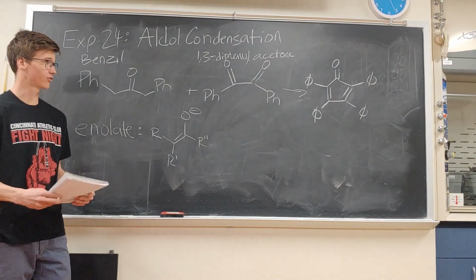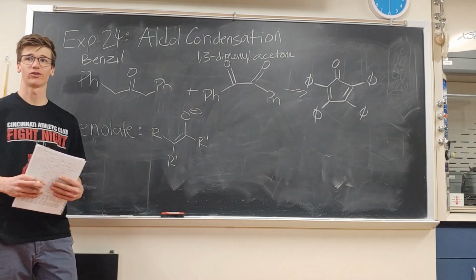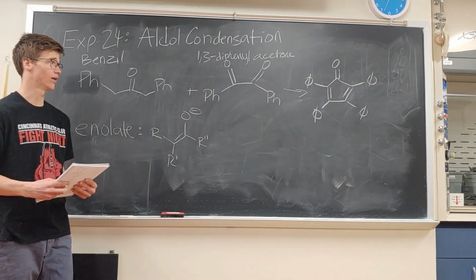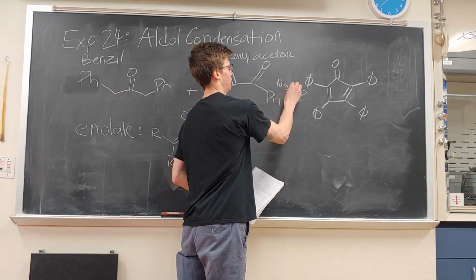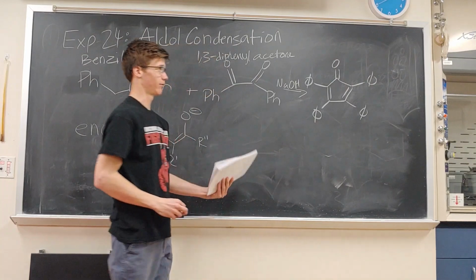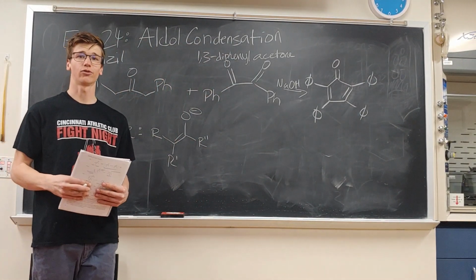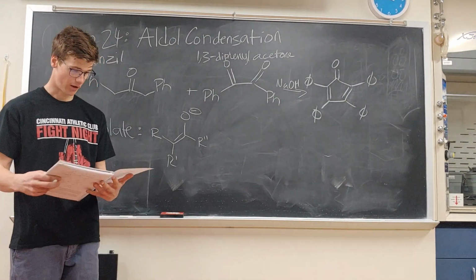So in this reaction, there are very few safety concerns you have to be aware of. However, we are using ethanol, which is flammable, so we do want to take those precautions as necessary, as well as we're going to be doing this reaction in the presence of a base, specifically sodium hydroxide. We're going to be using solid sodium hydroxide pellets, which are caustic, so of course if you were to do this lab, you want to be wearing your gloves at all times.